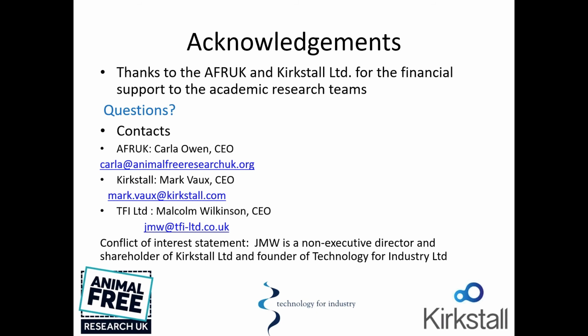The surprise is that it's actually easier than you might think, because cells condition the media, and particularly once you have multiple cell types working together, they signal to each other. We've got quite a lot of evidence from the different university groups using our system that this happens. So the answer to both those questions was yes, and there are a lot of published papers now showing the details of how these techniques have been set up in different research groups.